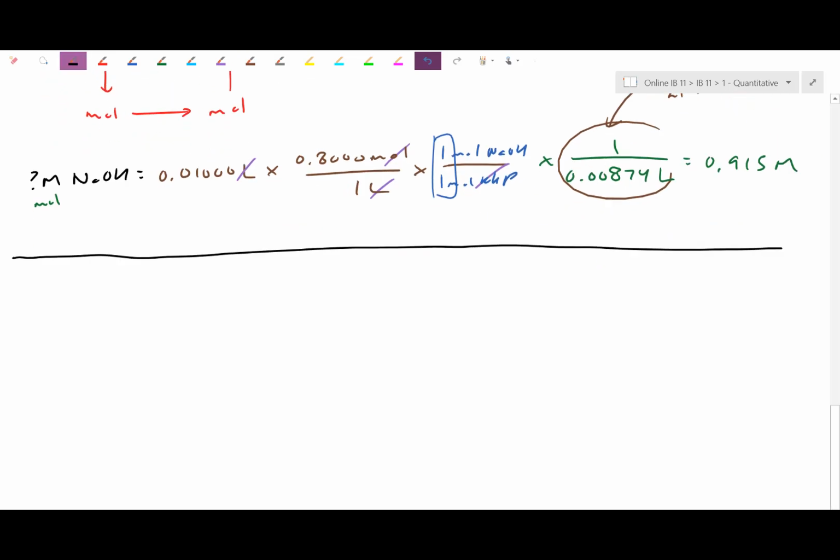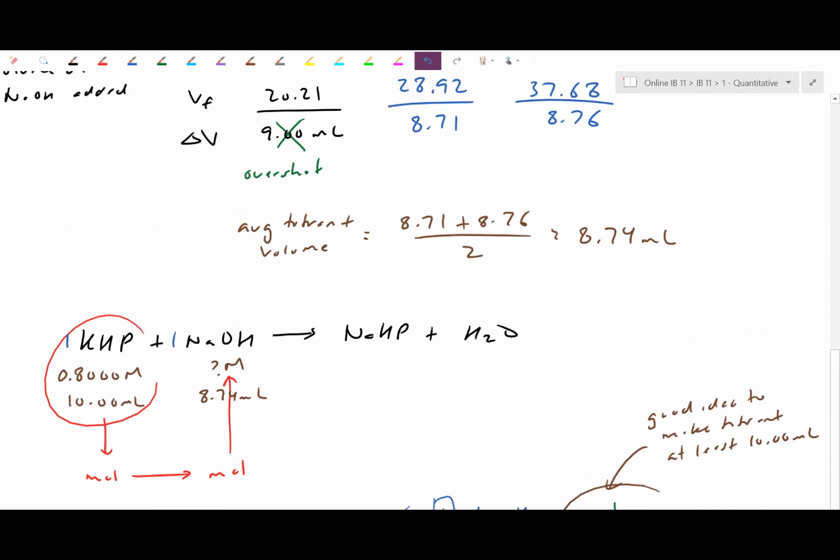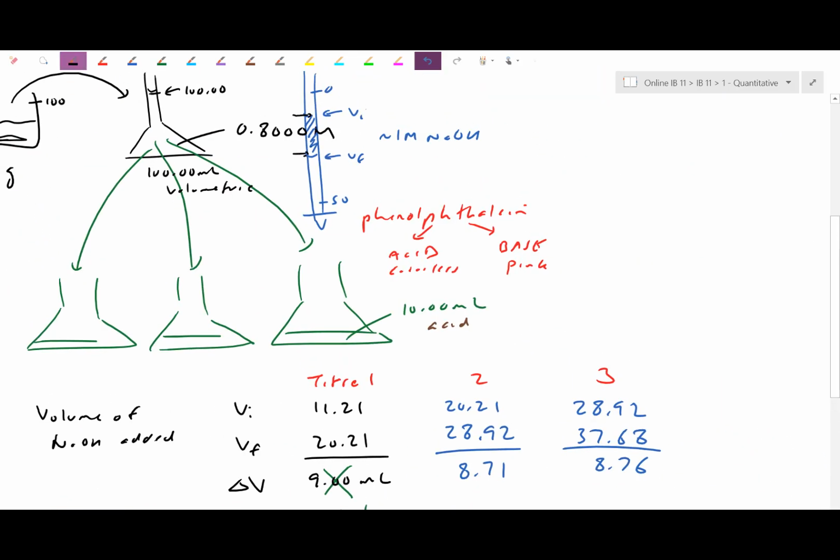For part 2, before we actually used the NaOH to titrate against the HCl, I knew the HCl was only approximately 0.1 molar. So what we did is we actually did a dilution. I took the NaOH solution. You'll notice that after you do the titration, the NaOH that you dropped in here has completely been neutralized. But fortunately for us, we still had some leftover 1 molar NaOH. I then took this NaOH. Now I know the concentration in here is that 0.91 number.